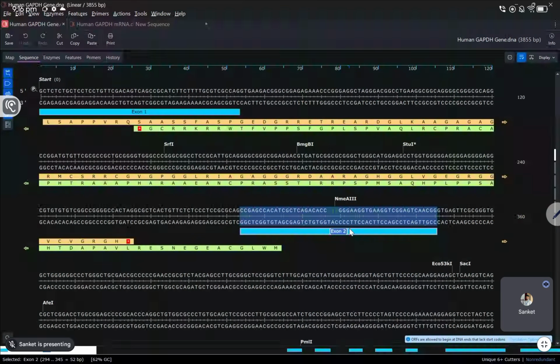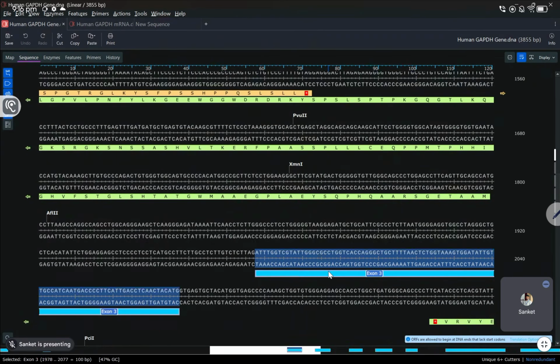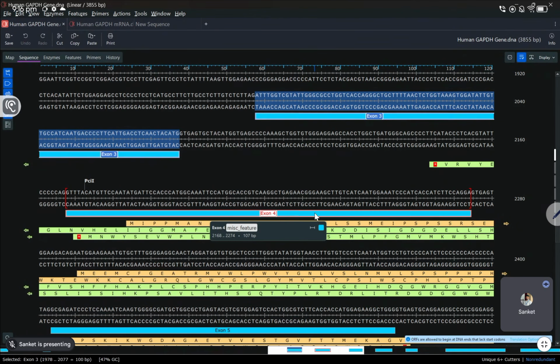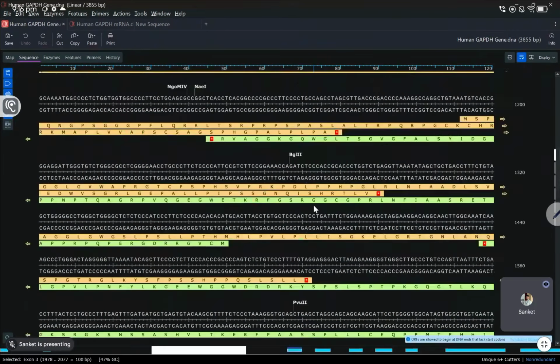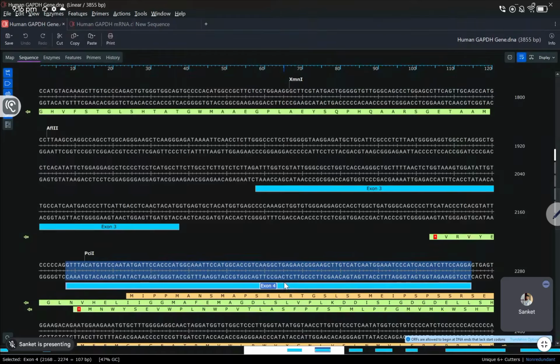This is exon 2, but you can also target exon 3, the next available exon. And if you don't find it there either, because there are a total of 9 exons, you can design guide RNA with exons 2, 3 and 4 in your design parameter.